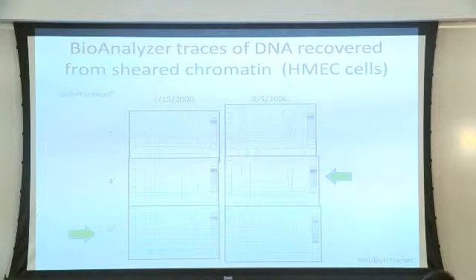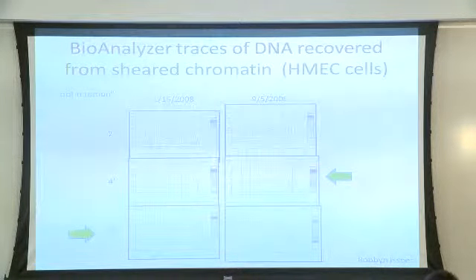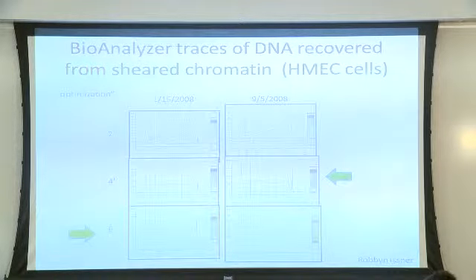In these pictures, the peak on the right represents a high molecular weight fraction, corresponding to this dark region on a virtual electrophoretic image here. This is a capillary electrophoresis-based method, but it has a synthetic image as if you would run a gel.